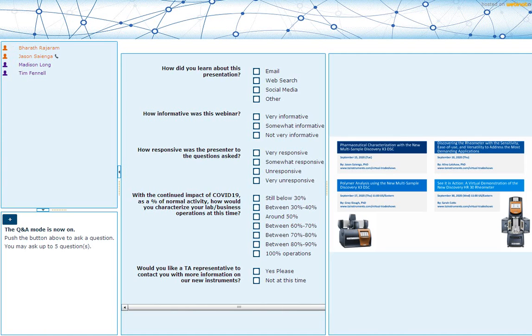Sure. The tan delta is a measure of damping, of the amount of energy that is dissipated as the material goes through the transition. So materials that have a greater tan delta peak height are dissipating more energy as they go through that transition compared to other materials.